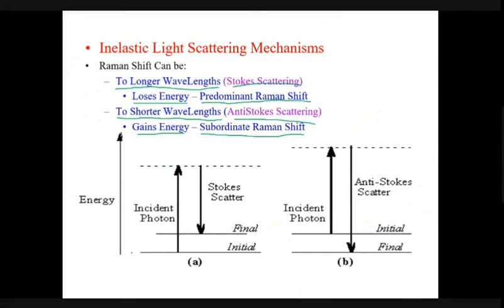See, this is the initial energy level. The laser light is bombarded on the molecule. After bombardment of that electromagnetic radiation, the molecule absorbs one photon and jumps into this energy level. But when it scattered that light, I should not say the electromagnetic radiation was absorbed by the molecule, I should say it was momentarily retained by the molecule.